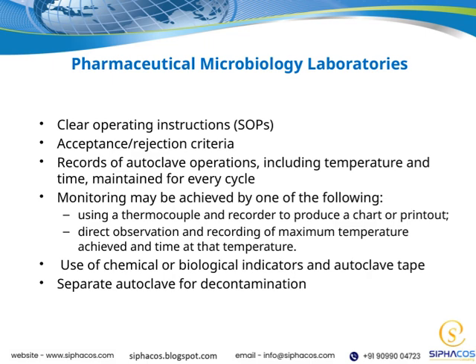And in some cases, especially when dealing with highly contaminated materials, a separate autoclave for decontamination is recommended to prevent cross-contamination. Finally, in our pharmaceutical microbiology laboratories, these practices are part of a broader quality control framework, ensuring that every step of sterilization is properly documented, monitored, and validated to maintain the highest standards of safety and efficacy.